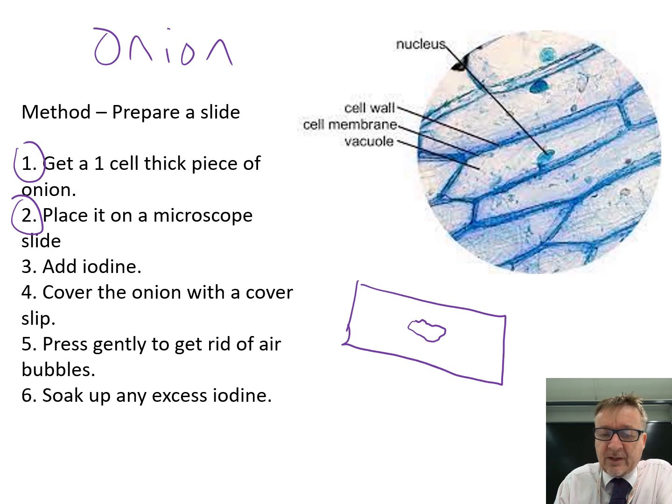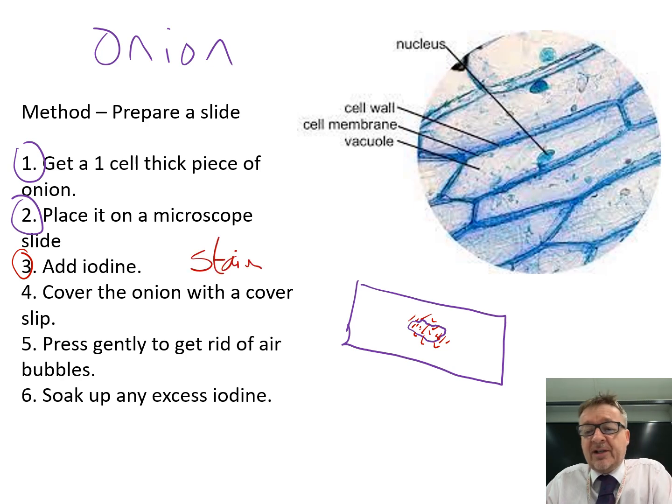Add a tiny bit of iodine onto the piece of onion on the microscope slide. Iodine is a stain, so be careful - it will stain your fingers, the desk, and any white shirts you're wearing.